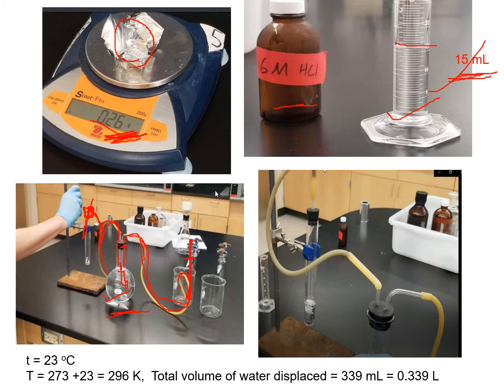So you need to continue doing this experiment until all the aluminum foil is gone, or you need to see here in the beaker whether the water is coming through this pipe. When the water stops coming from this pipe here, the experiment is done. So there are two ways to check whether the experiment is done or not. One is that you need to look here if there is aluminum and it is giving the hydrogen bubbles or not, or you need to look here if the water is still coming out of the pipe or not. If it stopped coming, the experiment is done and you can stop the experiment.